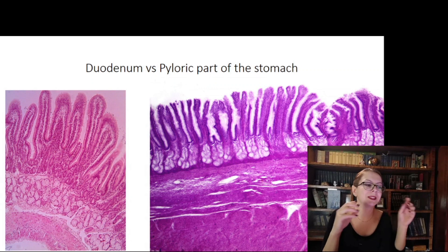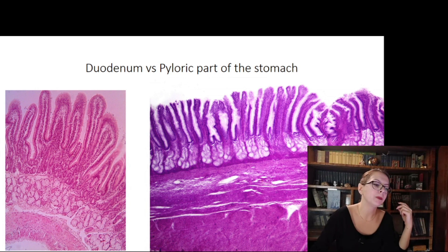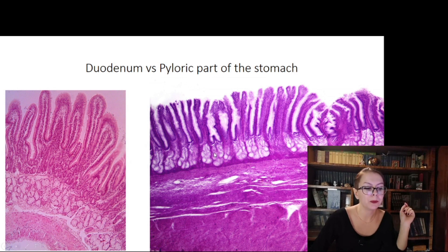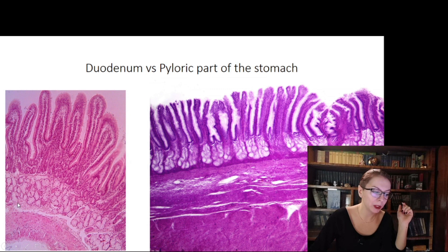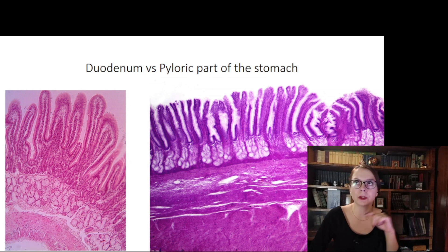The first pair to compare is the duodenum and the pyloric part of the stomach. These two specimens look similar because in the pyloric part, the gastric pits are rather deep and could be confused with the villi in the small intestine. In both the pyloric part and the duodenum, mucus-producing glands are also present. But what are the two criteria that help you distinguish them effectively?